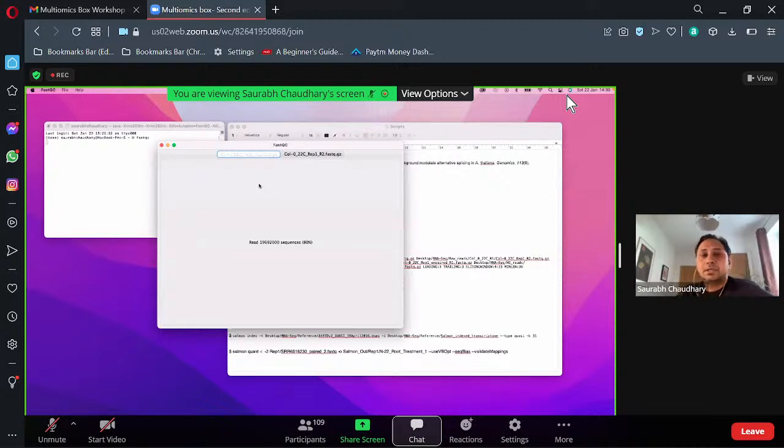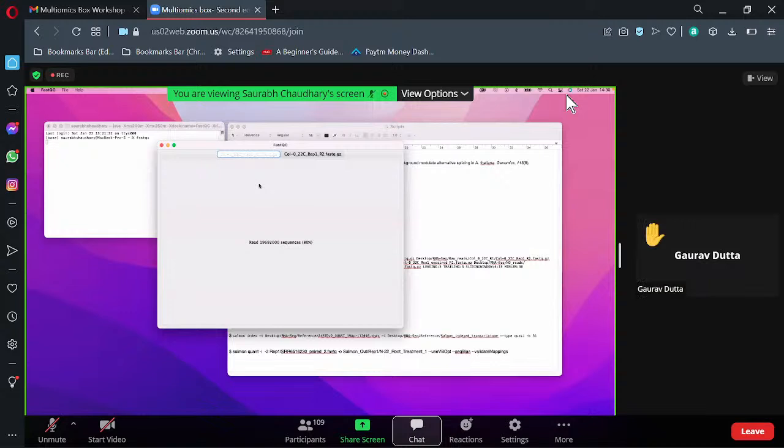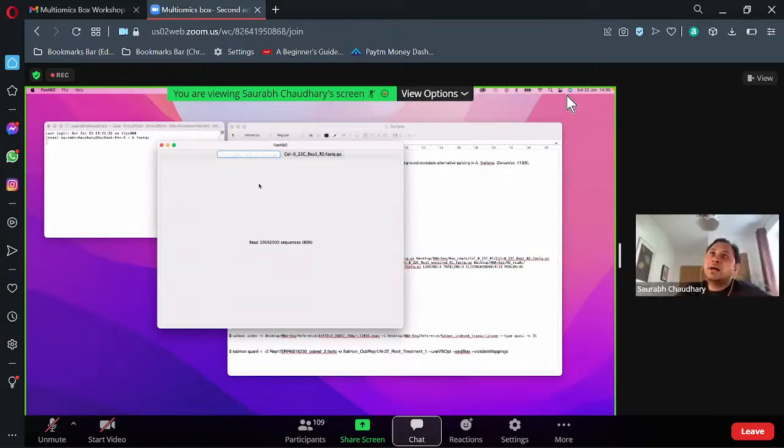Okay, thank you, sir. About STAR and HISAT2, can you please elaborate? Yeah, STAR. I'm not going to use STAR. Why I'm going to use Salmon, I will tell you in the next session. But STAR is a splice-aware tool which you can use for any samples, any organism's RNA-seq data, but it's mainly used if you have a big genome.